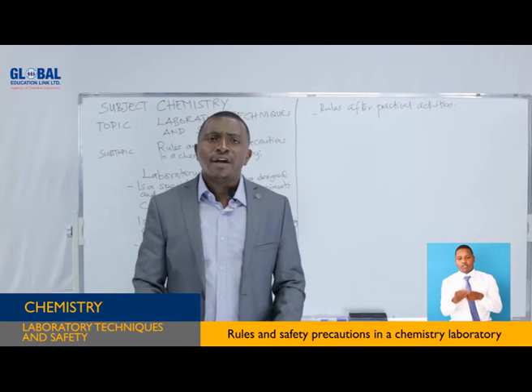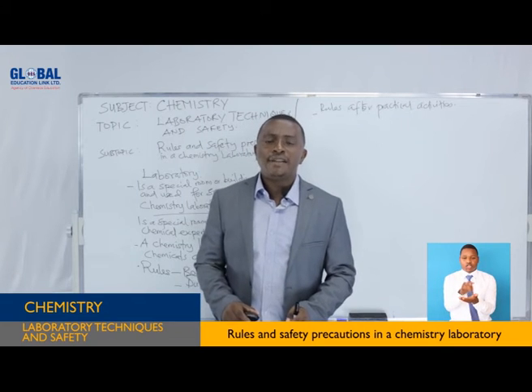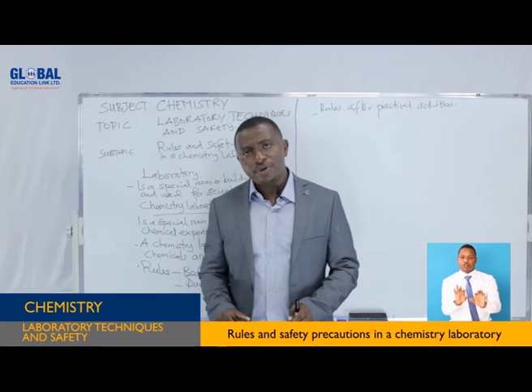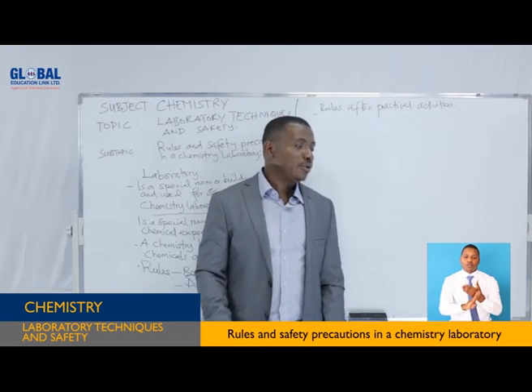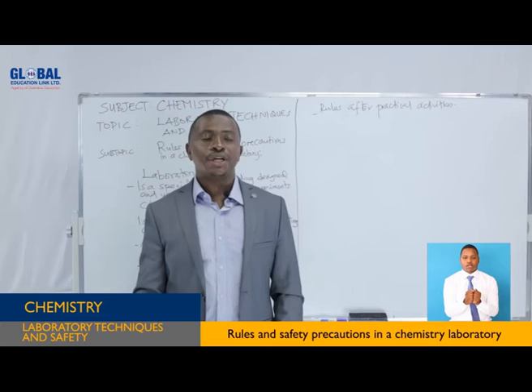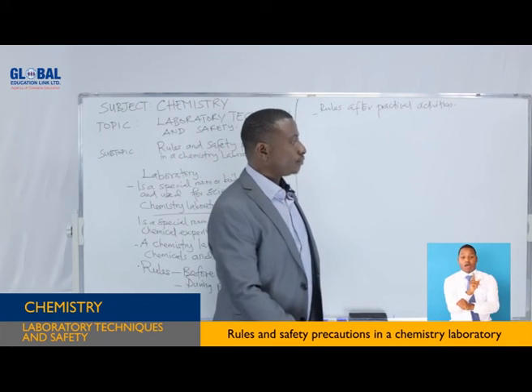So the reagent bottles and other chemical substances should be properly stored in cupboards with drawers, and they should be well locked to avoid contamination with these harmful chemicals, which can result in accidents or can harm someone that has come in contact with them.